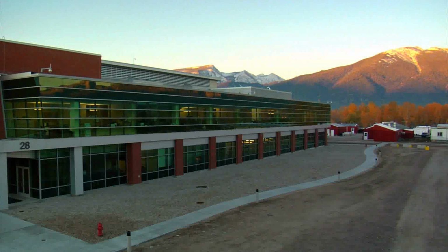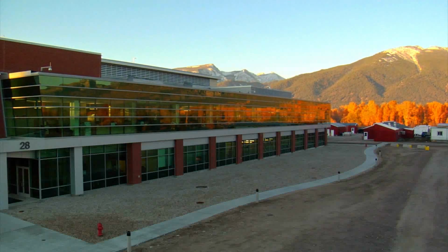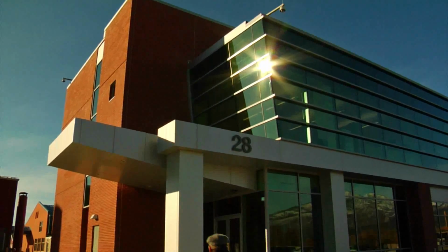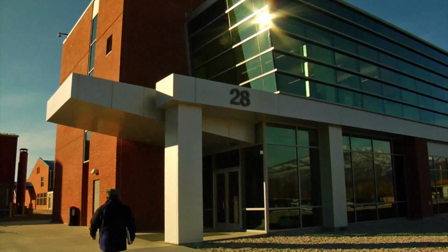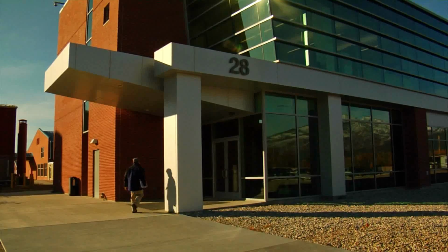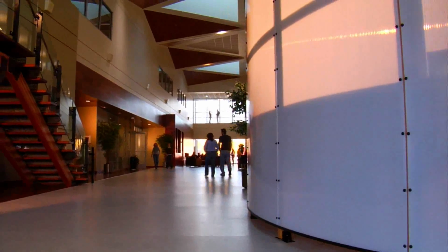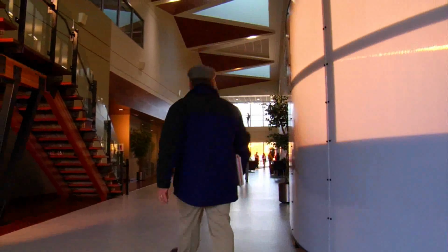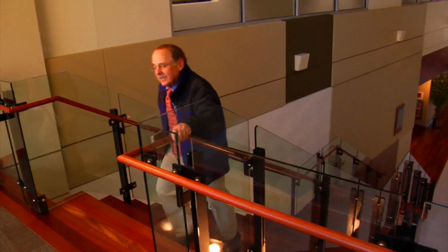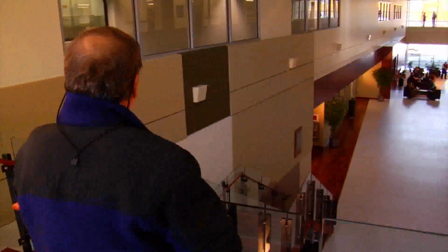In response to this public health research directive, Congress authorized $66.5 million for construction of a biosafety laboratory and related infrastructure. The Rocky Mountain Laboratories in Hamilton, Montana, was chosen as the site for this facility. That new laboratory, known as the Integrated Research Facility, opened in spring 2008. Join us now for a tour and commentary of the IRF and its special features.